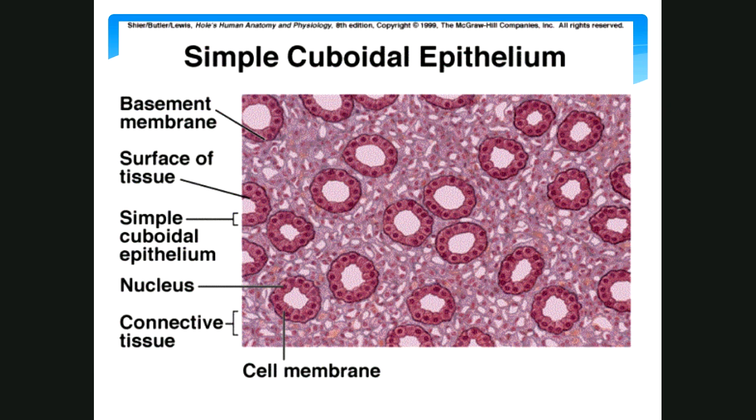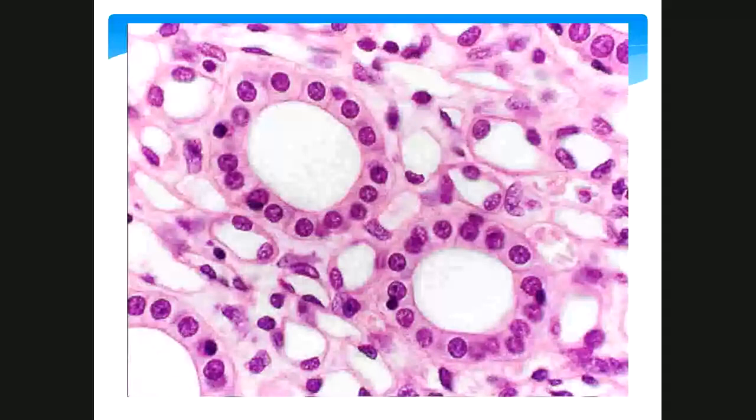We had all these different slices, and each slice of that boiled egg looked different. In this picture, it's a little more obvious. There's the tube. There's another one. There's another one. There's the hollow space in the middle, and you can see these little cube-shaped cells with a round nucleus. Well, that was a drawing, but this is an actual picture. So there's our hollow space, and here's our cell. There's one cell right there. Here's another cell, another one. And so some of these are perfect. Some of them are not perfect, but still, that's what they're supposed to look like.